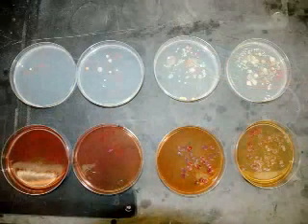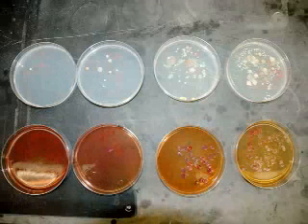Pictured here are typical results of a dilution plating. By counting the number of colonies and determining the total dilution of a sample spread on a plate, it is possible to determine the colony forming units in the original sample.